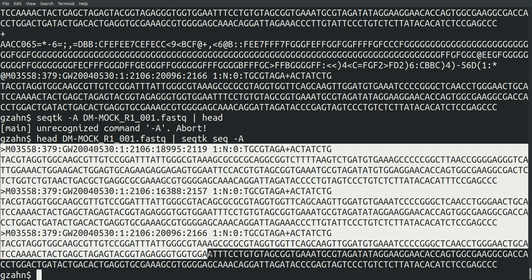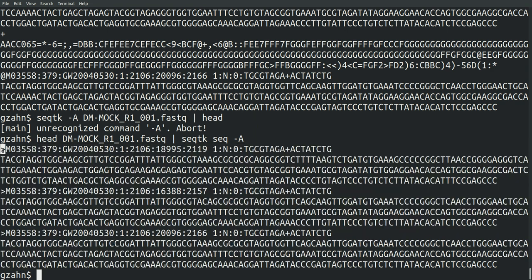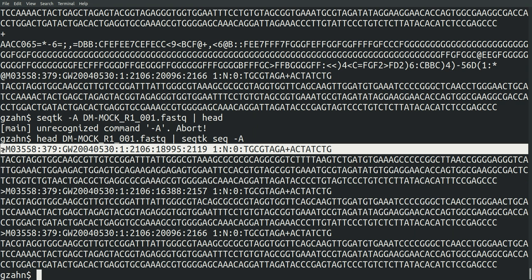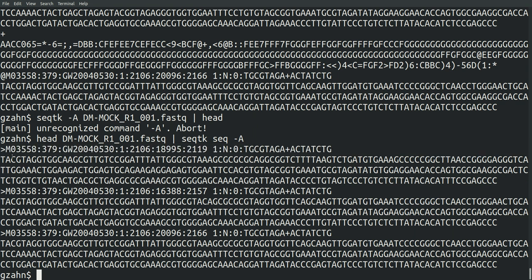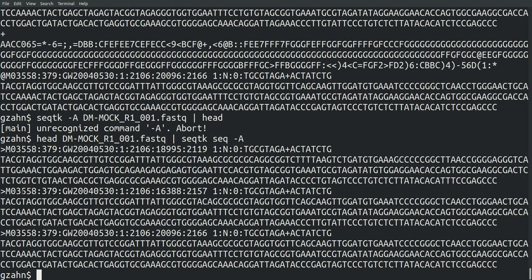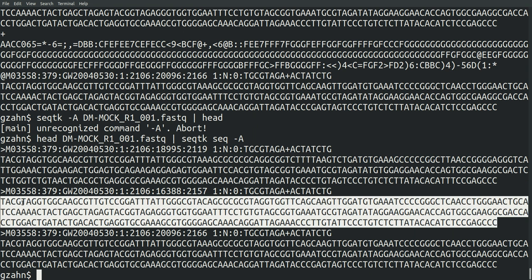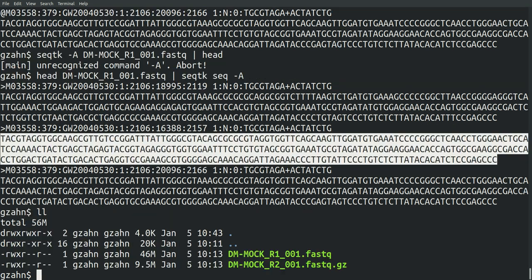So this is FASTA format. And it differs in that it's in every other line. Instead of every four lines, it's just the name of the sequence and then the sequence. The name of the next sequence and then the next sequence, all the way down.